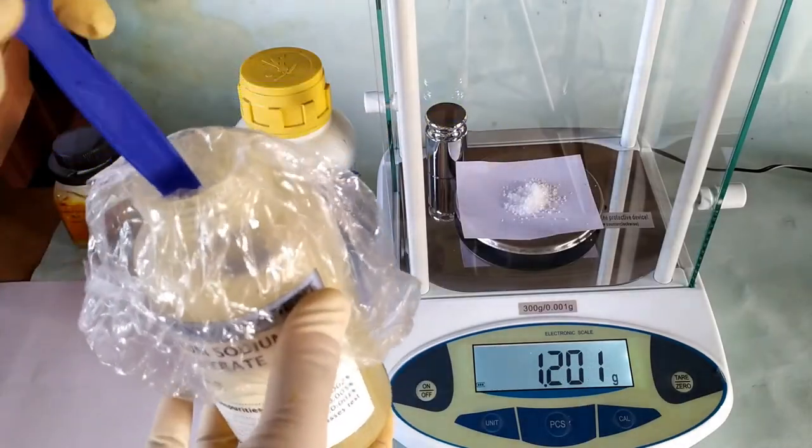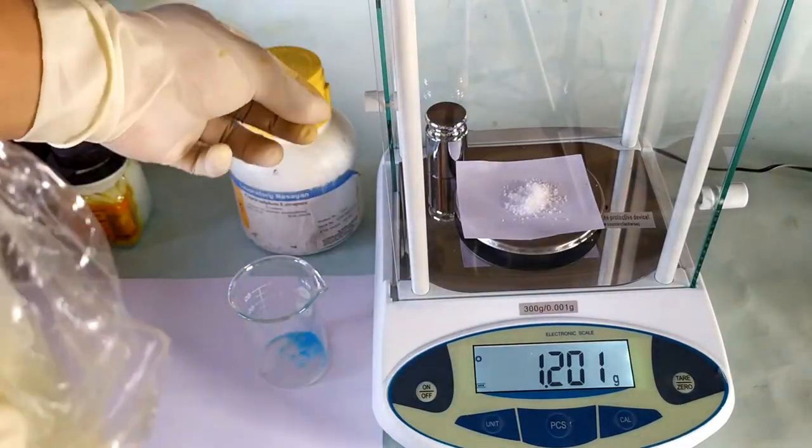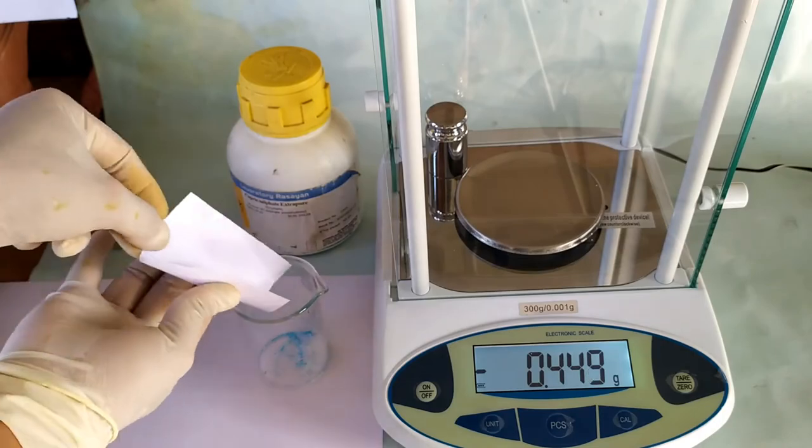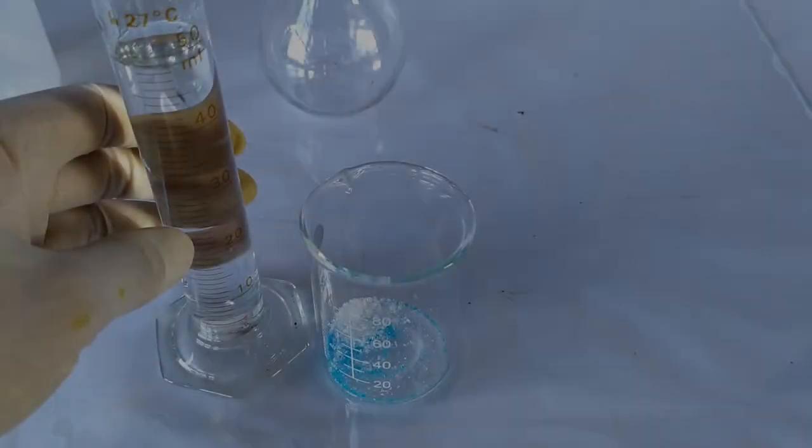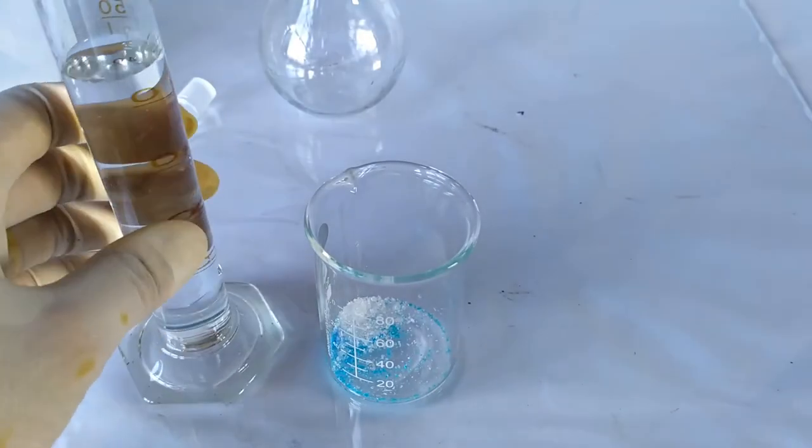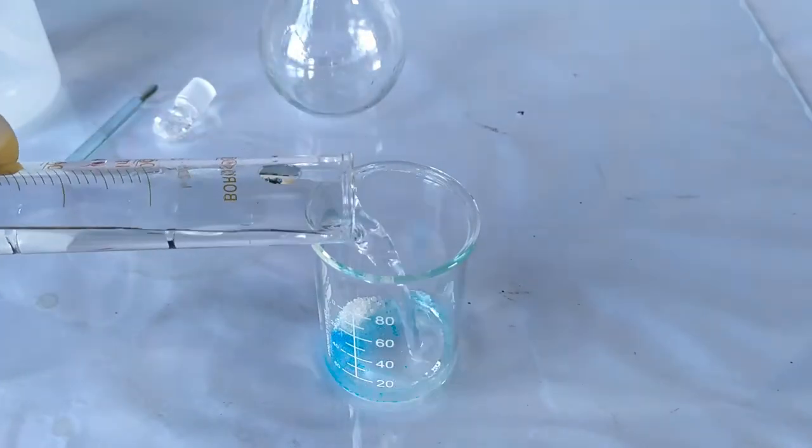Also weigh exactly 1.2 g of sodium potassium tartrate and transfer it into the same beaker. Now add about 50 ml of distilled water to the beaker and stir to completely dissolve the salts.